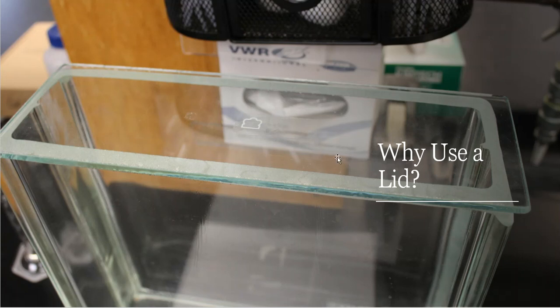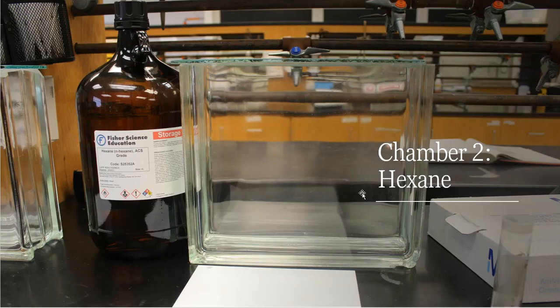Another reason that we put a lid on in the very beginning is to make sure that the chamber gets fully saturated with vapor. So these things are volatile, which means that they do evaporate quite easily, and I want those vapors to completely fill my TLC chamber. My separation happens a little bit faster that way. My plate sucks up that liquid solution a little bit faster. I know that seems kind of strange, but when we do this, we equilibrate the chamber, and that's why we do what we do.